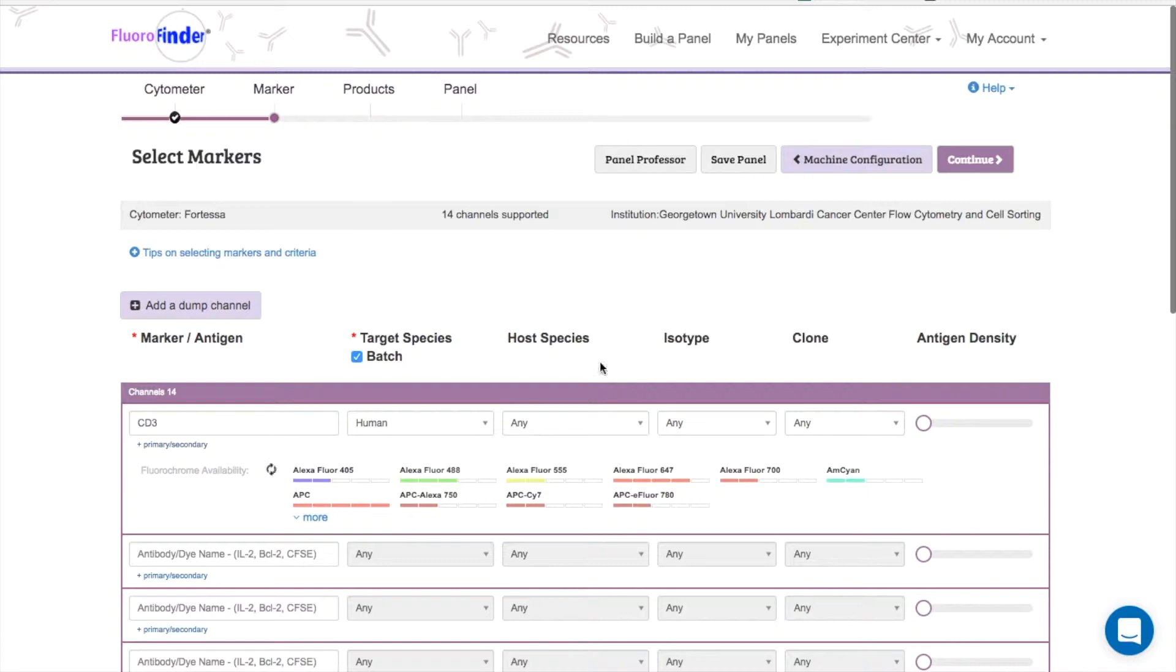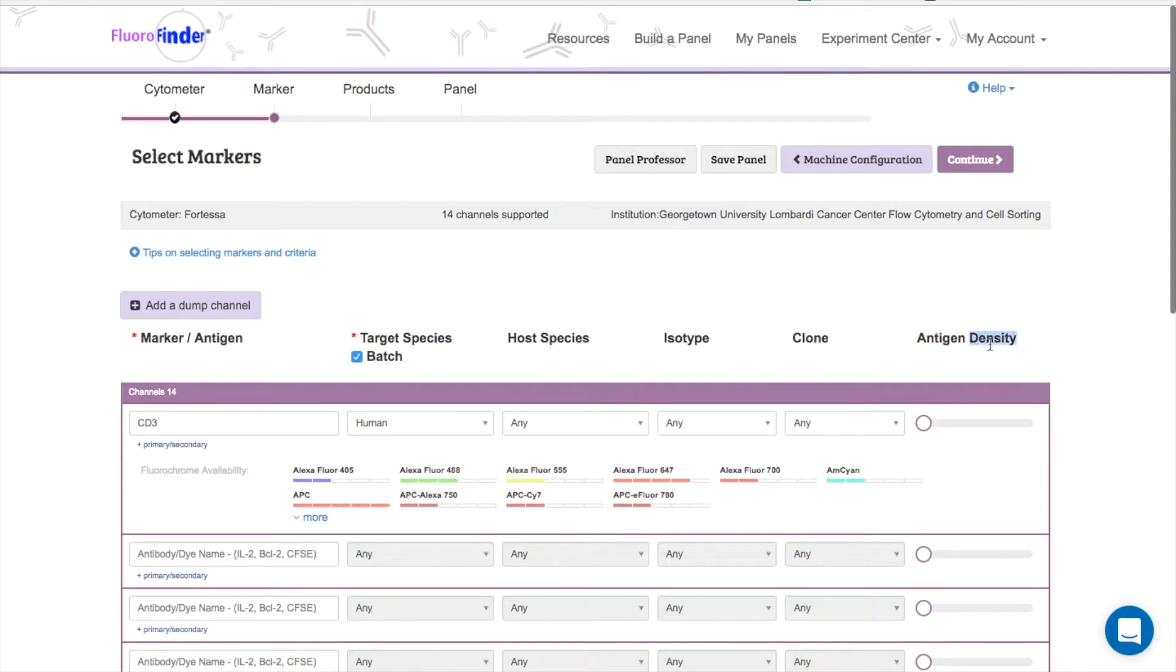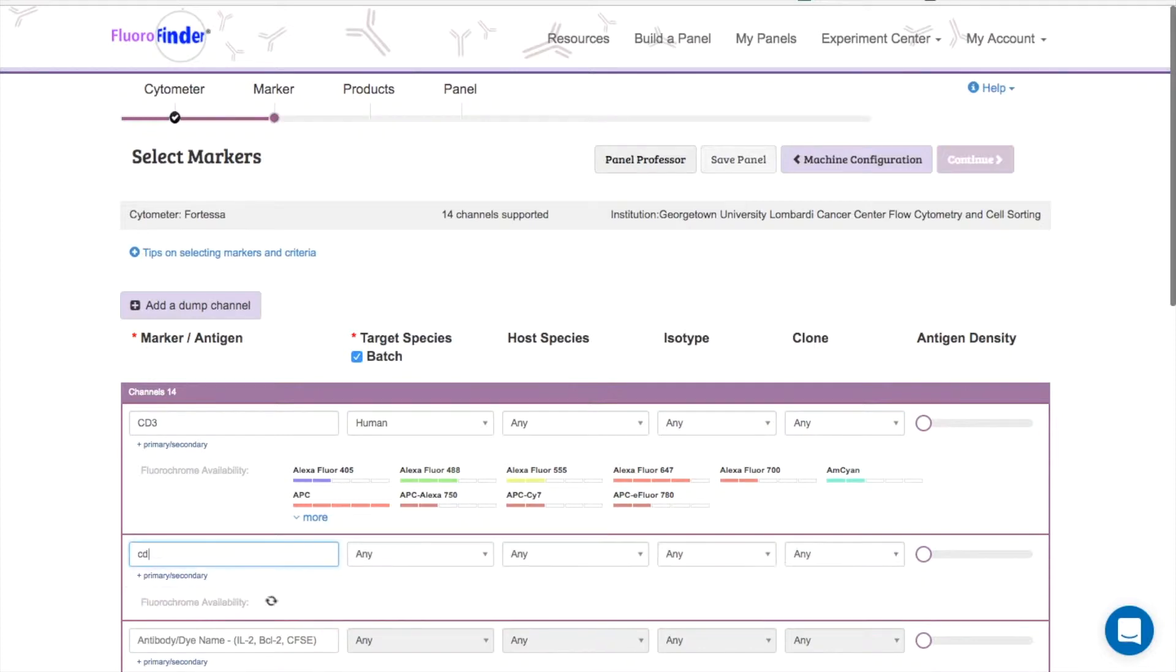You can use these other fields to select host, clone, and isotype, but keep in mind that these options will limit the number of products you will see on the next step. This is especially true if you use the antigen density slider. This will limit your results based on their relative brightness.